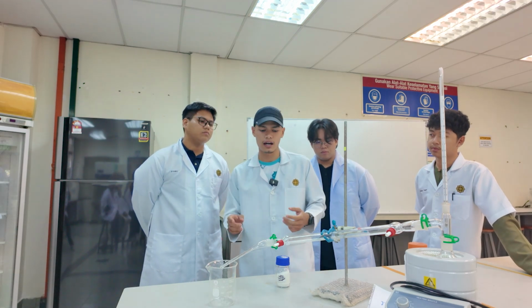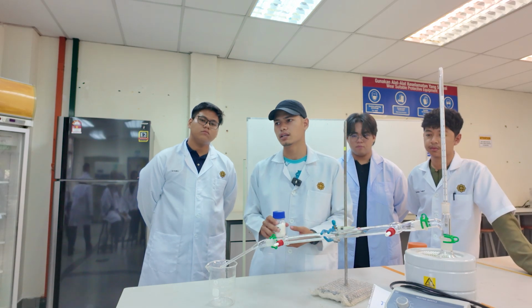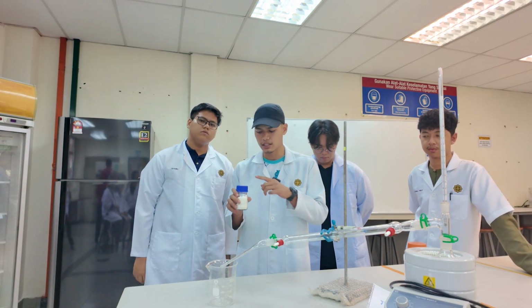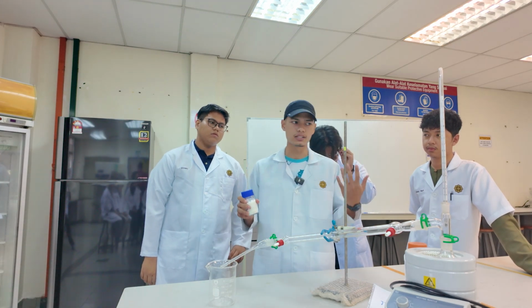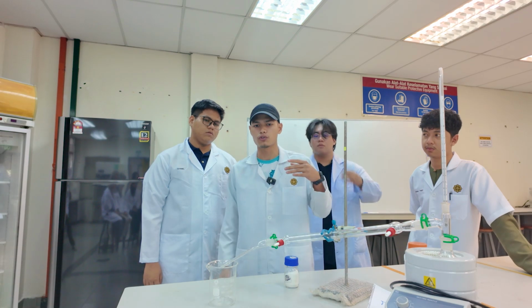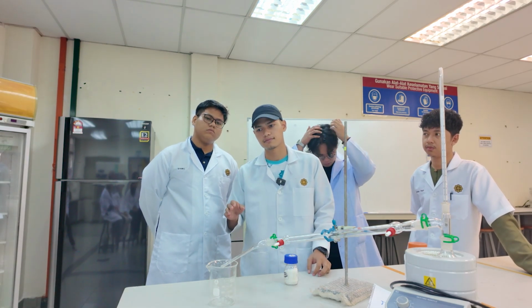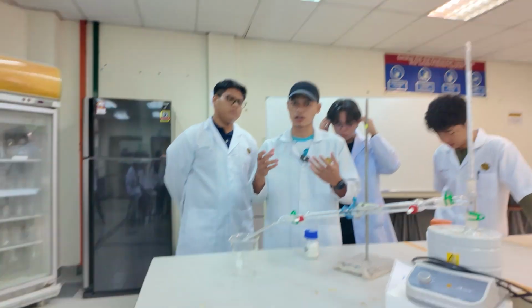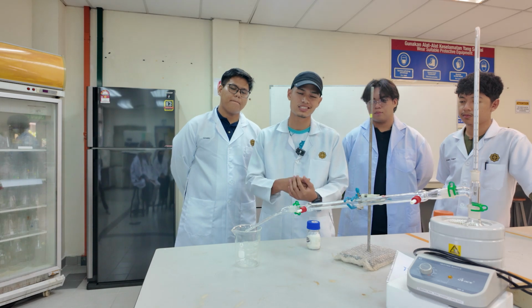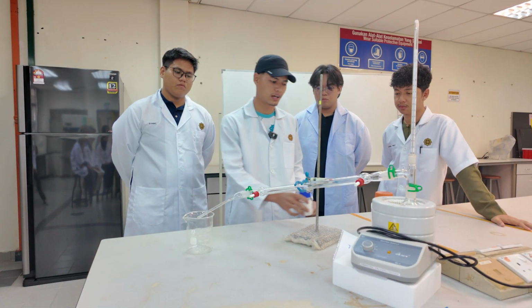So for example, with another compound, when we add water to it, it becomes a solution. But with anhydrous sodium sulfate, when we add water to it, it will become a salt, the salt that bonds with water. So it will absorb all the water and remove it, to make the compound more pure, less moist and less watery. So that's the precaution that I want to mention.